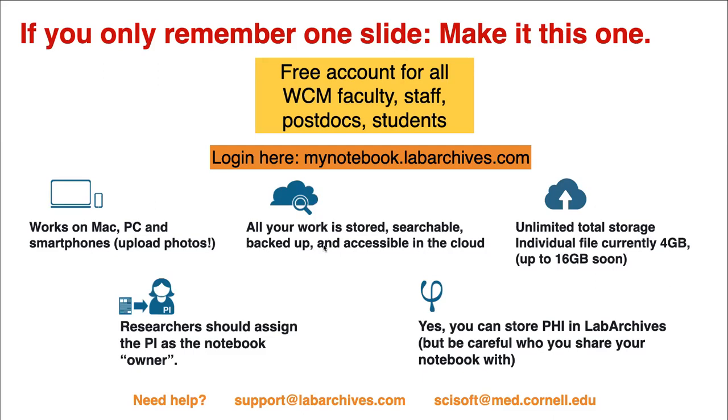So you don't have to worry about keeping multiple copies of what you're doing, as if you use some other electronic storage. The total storage per user is unlimited. At the moment, the individual file size maximum is 4 gigabytes, but we're going to increase it pretty soon to 16 gigabytes.